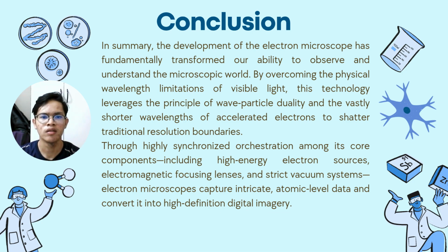In summary, the development of the electron microscope has fundamentally transformed our ability to observe and understand the microscopic world. By overcoming the physical wavelength limitations of visible light, this technology leverages the principle of wave-particle duality and the vastly shorter wavelengths of accelerated electrons to shatter traditional resolution boundaries.